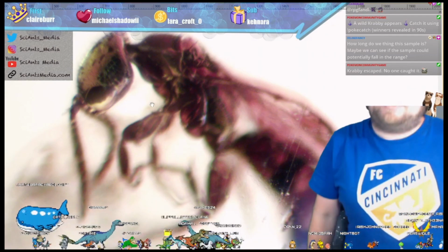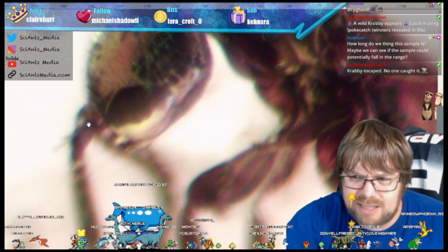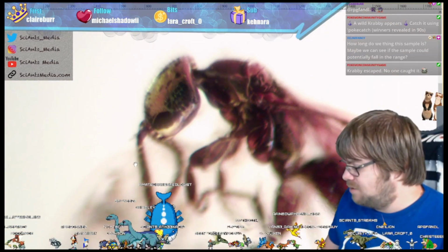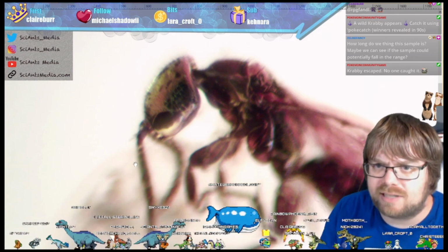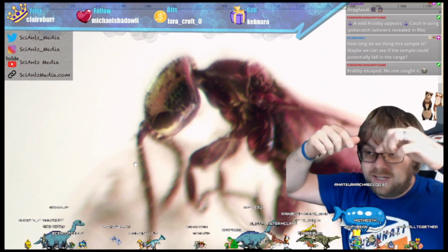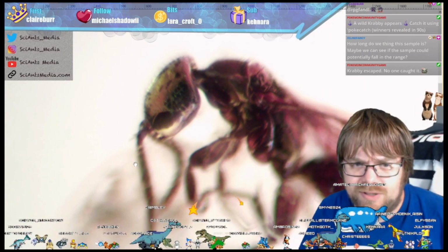This is me trying to hold it and to get like a nice zoom in of the antennae. I think we'll need to look at the other side for the antennae, but it is also looking similar to the wasp that we were looking at earlier because there's two segmentations, it looks like, for the antenna and its start point, which we've seen as a variety, let's say, right? So there's some wasps that we've looked at that have bifurcated antenna, so it's one piece that comes out and then splits apart. And then we've also had the two different ones come out. And so this one, when looking at our reference that we suspect might be, has two nubs that then come out. And that I think is what we're seeing here as well.